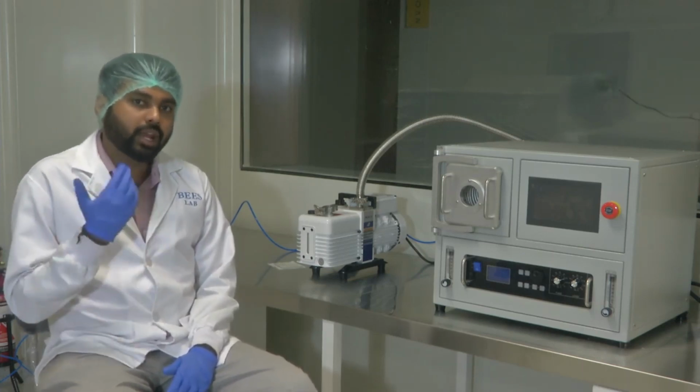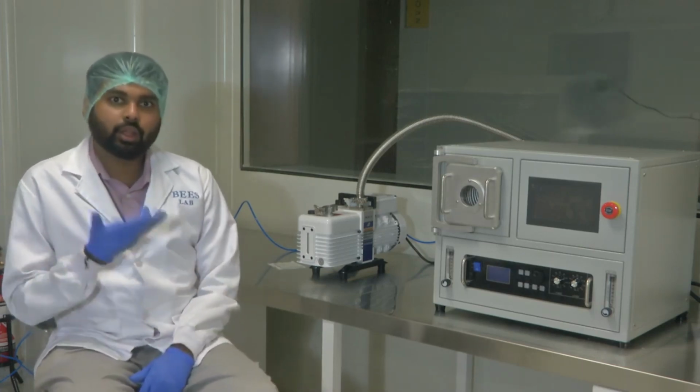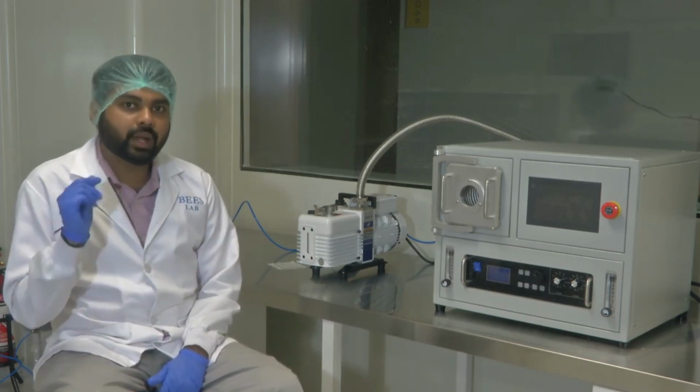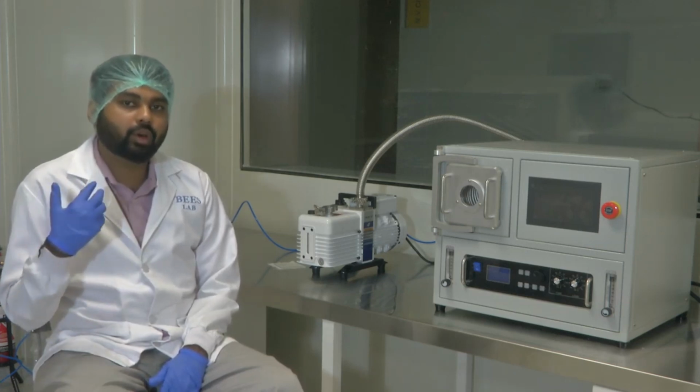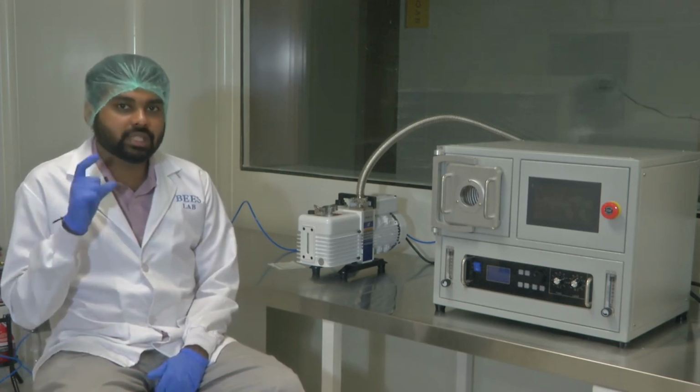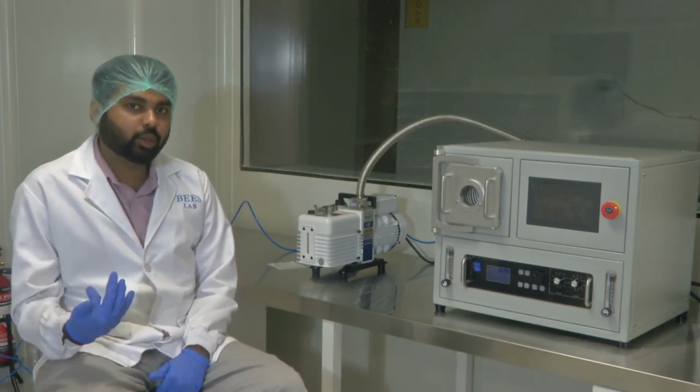Now if you try to do the same in normal air, you don't know, there are a lot of constituents, there is oxygen, there is nitrogen. You cannot fix a particular RF energy level for the plasma to form. So it's very random. That is why we need a vacuum system. Okay, we have a vacuum system.